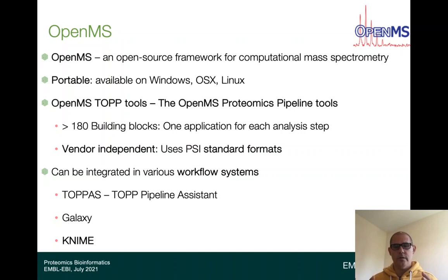A workflow system is basically a software tool that enables you to distribute tasks in a more distributed environment. Let's say a computer cluster in HPC, or a cloud environment, AWS. This kind of infrastructure where the tool doesn't run only on one big machine, but on multiple specific machines.